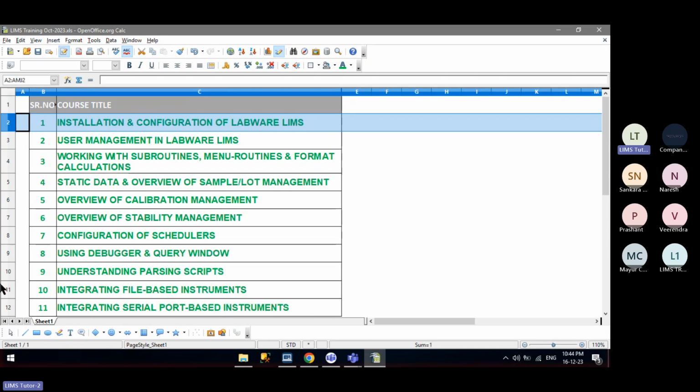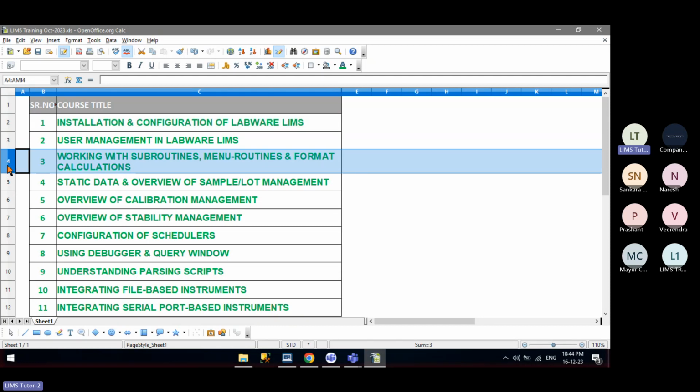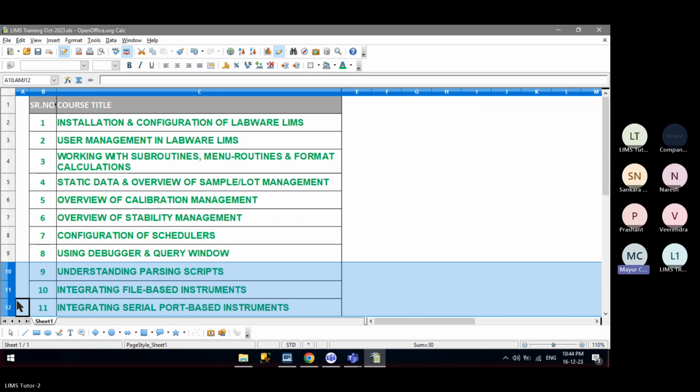Okay. So we have installation, we have programming, and then we have instrument integration. Yeah, I would like to learn more about the sysadmin role. Presently, we have a sysadmin to perform subroutine calculations and all the technical part. So I can learn more about that in these sessions, so then I can tell the business people what we need to make things better on site.